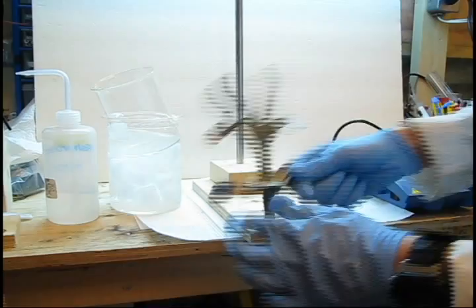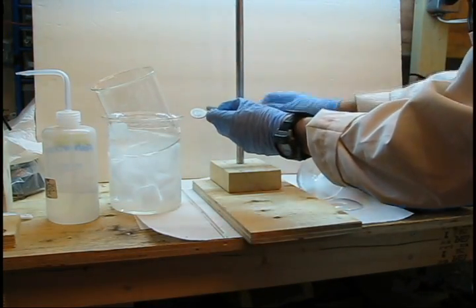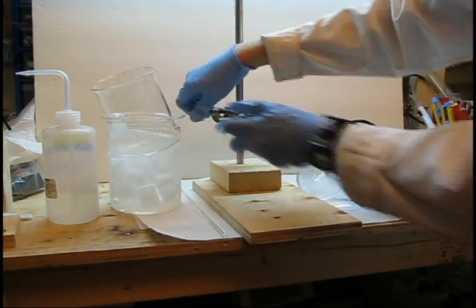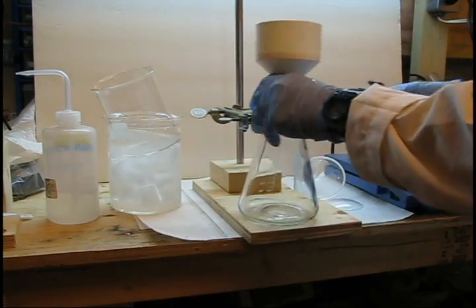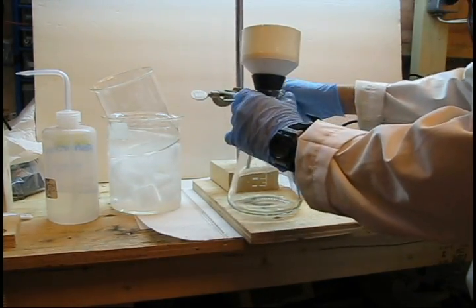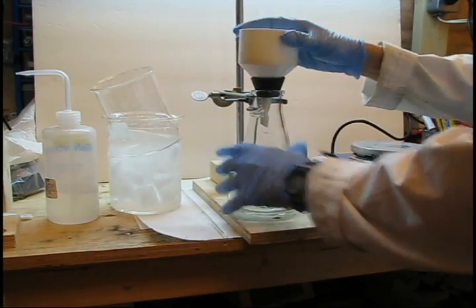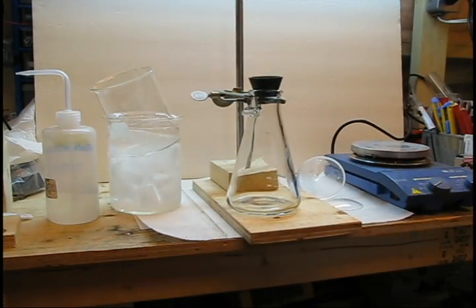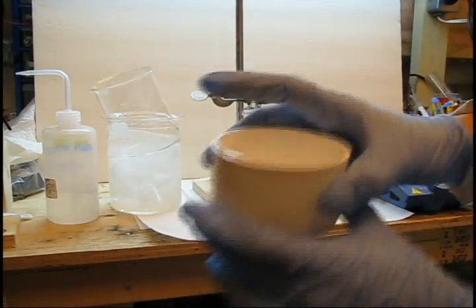While your isopropanol solution is cooling, set up your vacuum filtration flask and funnel. Clamp the flask to a stand because the flask can tip during filtration. Don't forget to place a piece of filter paper into the funnel at this time.